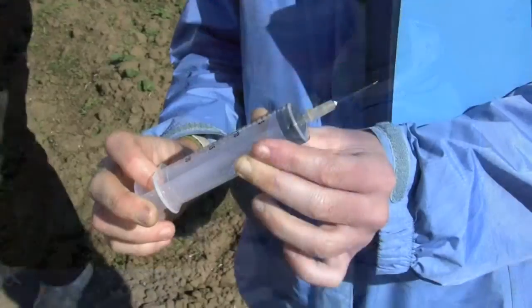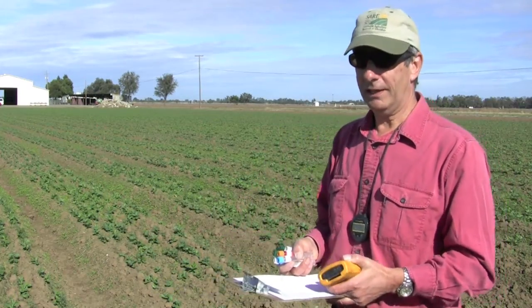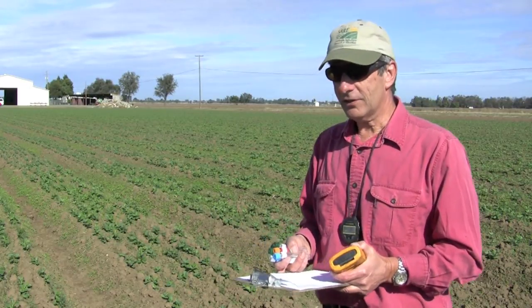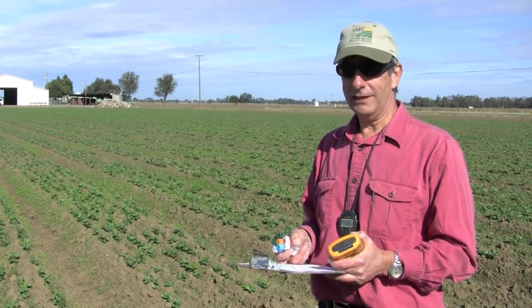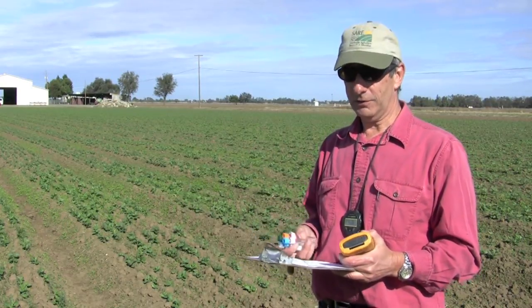We take these air samples and analyze the air with a gas chromatograph in the lab. Based on these concentrations, we can calculate the rate that the nitrous oxide is emitted from the soil.